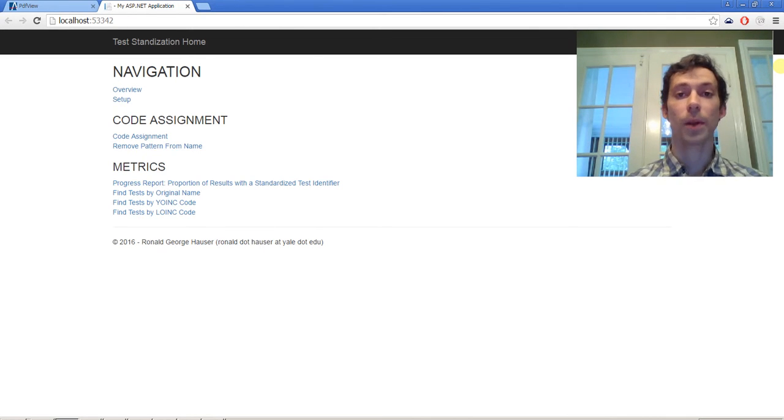Most of the time when people have a project that they need to have laboratory data for, they standardize just the small section that's useful for them. And when people do that repeatedly over time, they often overlap each other's work. So one of the main purposes of this project was to provide a baseline so that regardless of the project you're using, you can still have a common service where you can get your data from.